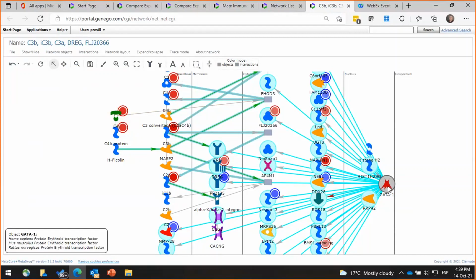So we're beginning now to use MetaCore to show potential processes that are taking place, signal cascades, potential upstream drivers, generating hypotheses of where to explore next, identifying even maybe in the future a potential target we could tweak through a drug approach to modify this cascade. All of these suggested with MetaCore here.